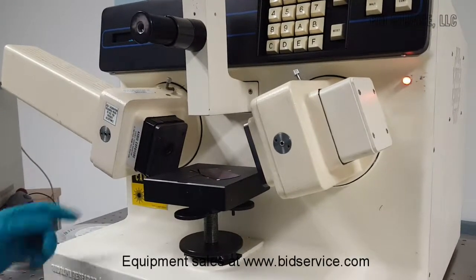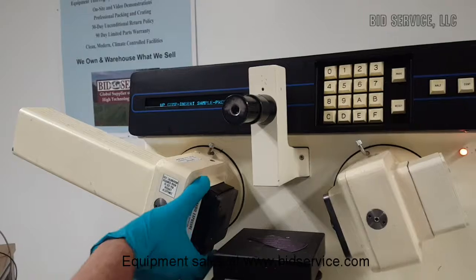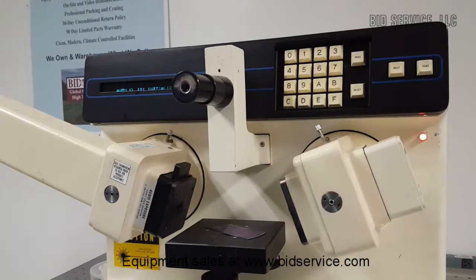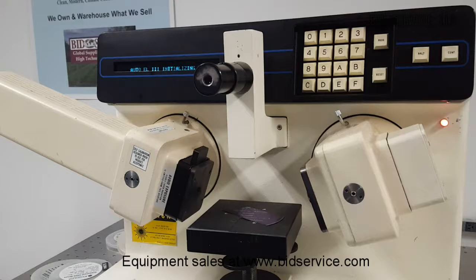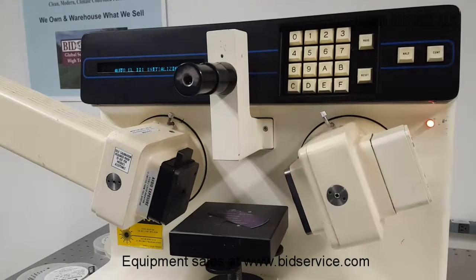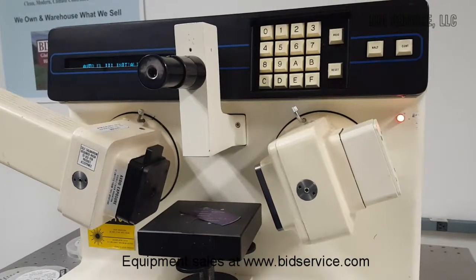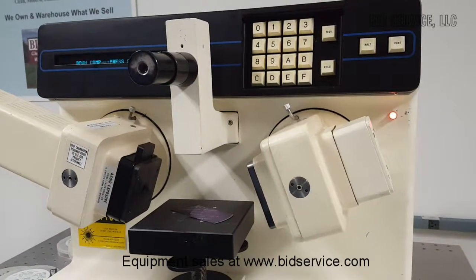On power up, the system will respond with 'up compensator insert.' This is the compensator insert — you push it up; it's a mechanical plate. Then press the continue key to start. The software initialization revision on this system is 508. The unit includes a thermal printer, and there's also an RS-232 port available for connecting it to any other unit.